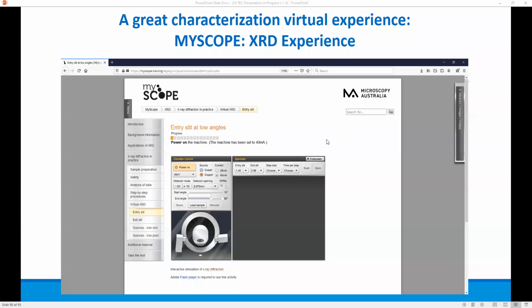Yeah, so the last thing I would like to emphasize is the X-ray diffraction simulator, with which you can also carry out a simple experiment in your classroom with your students, where you have this simulator and the X-ray is coming from this direction and is received from this direction. Fortunately, at this time, I think they're going through some website repairs, so I couldn't get the simulator to work, but it's located on that side, and the applet looks like this.